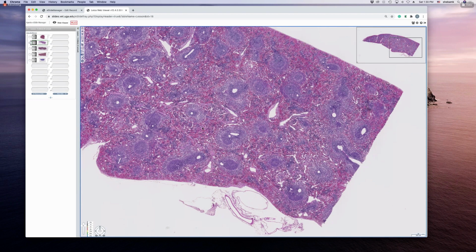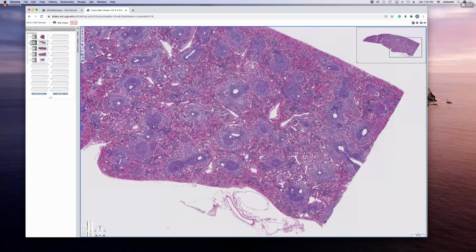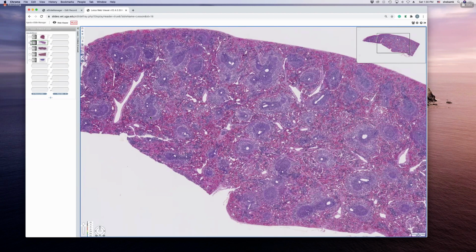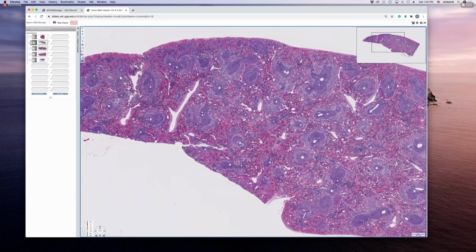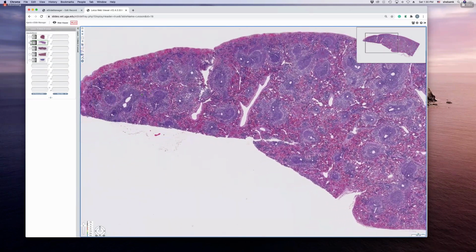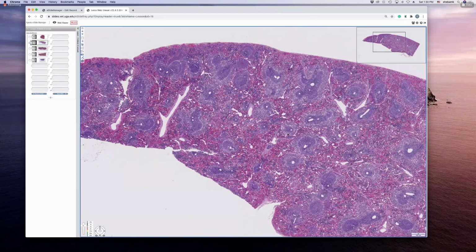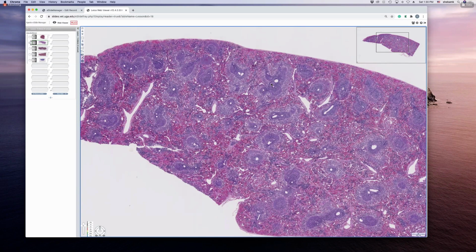So what is this artery called in the middle, or arteriole? Central artery, central arteriole. Sometimes the central arteriole will branch off, it will give rise to two arterioles, and finally it will become capillaries ultimately. But before they become capillaries, there are a few of them, like right there, these are called penicillar arterioles.